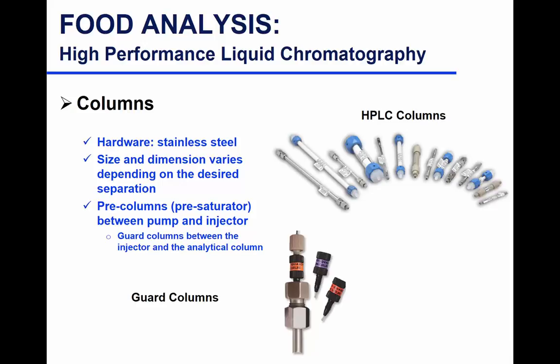Pre-columns or pre-saturator between the pump and the injector. The most common pre-columns are guard columns. The function of a guard column, and those of you that did HPLC saw that, I'm going to pass around a very fancy and expensive guard column for you to have a look at. Guard columns also come in different shapes and types.